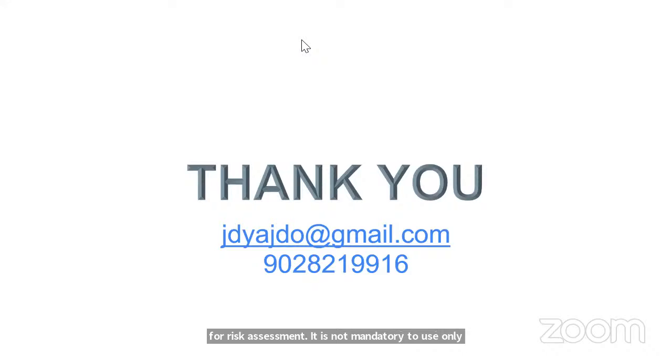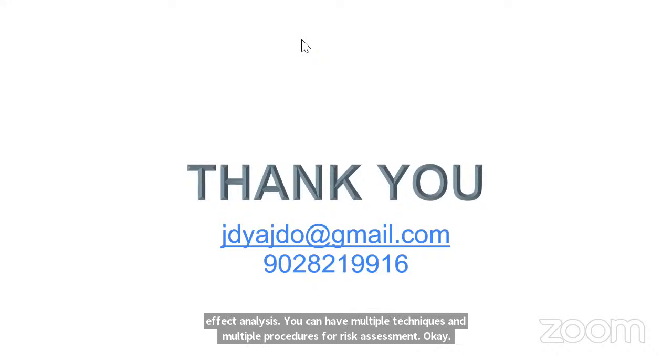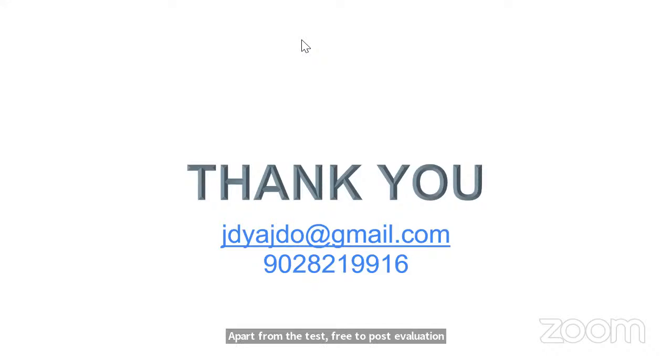Apart from the test, pre to post evaluation, request processing, IQC, reporting, what other general risks can be part of the risk assessment checklist? So equipment you can use, appointment of new manpower, appointment of new personnel, trainees working in the laboratory. You can also check risk associated with your infrastructure, that also can be included as part of risk assessment in your checklist. Is risk analysis of staff safety included in risk analysis or not? Yes, it is included in the risk analysis, as I have just mentioned.